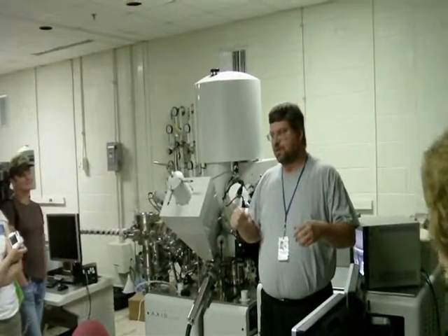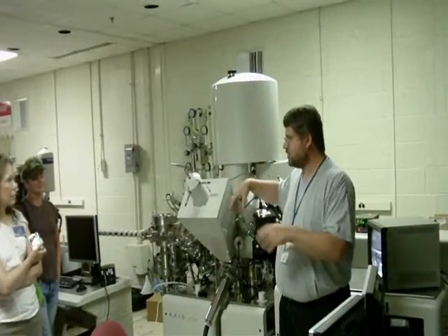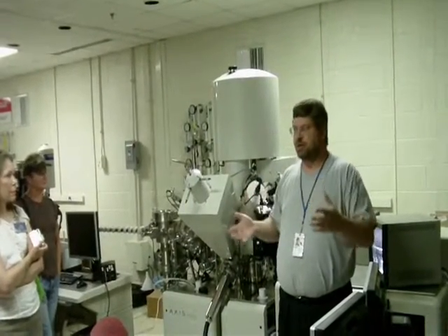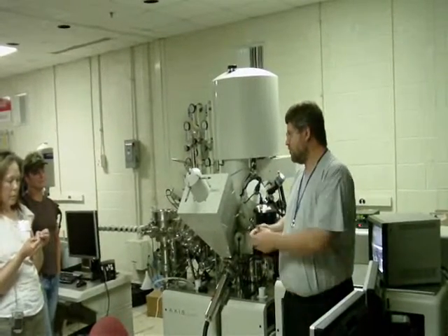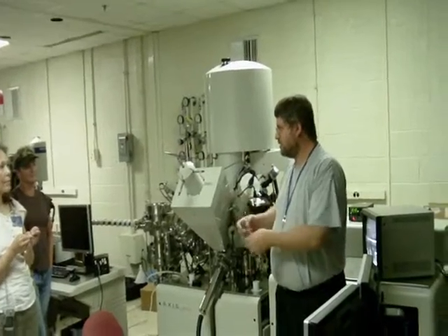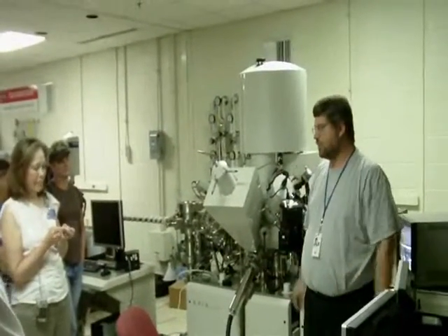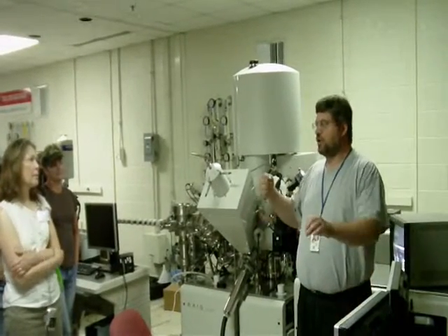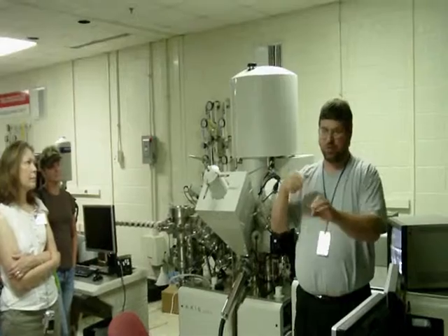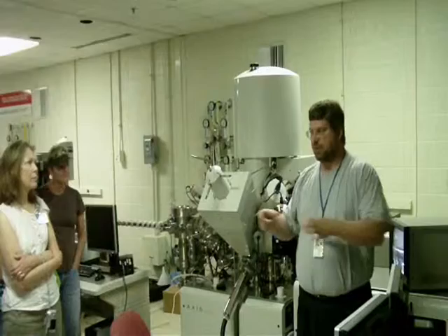The electron microscopes work a little bit differently than this instrument. They kind of work like an optical microscope — everybody's looked through little optical microscopes, looking at plugs or whatever, and you magnify them with light coming through a lens to make things look bigger. With an electron microscope, you have what's called an electron gun. It just shoots a single beam of electrons, a very fine beam of electrons, and we use electromagnets to move that beam around.